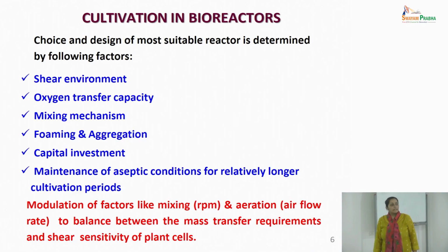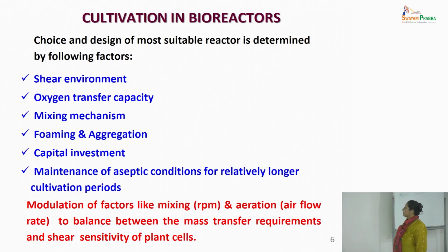Capital investment is also important. In the end, whatever design you choose, cost matters. So that is also one of the factors to be kept in mind. And knowing that these are long run fermentations, is the design capable of maintaining sterility for a long time?